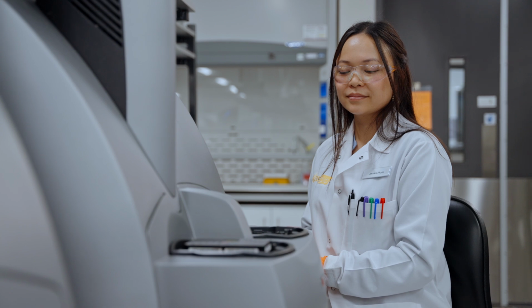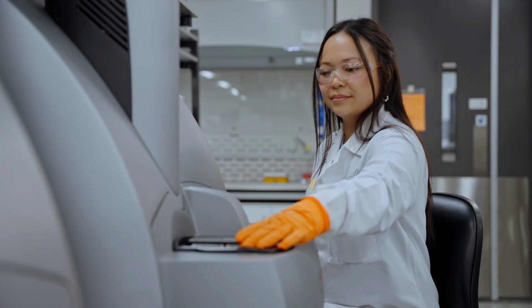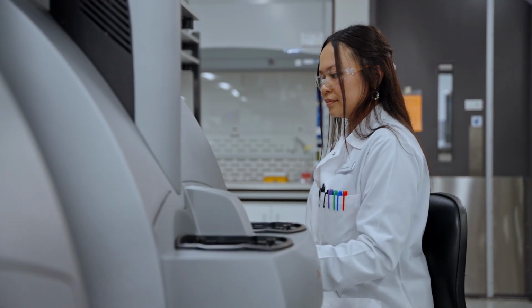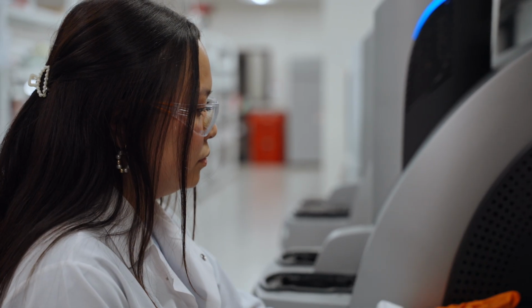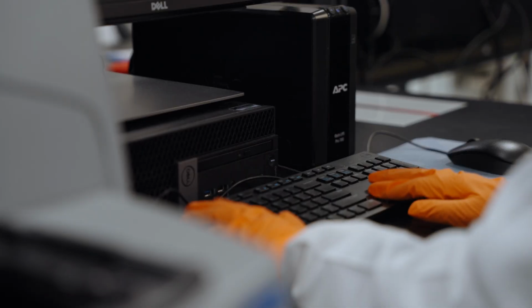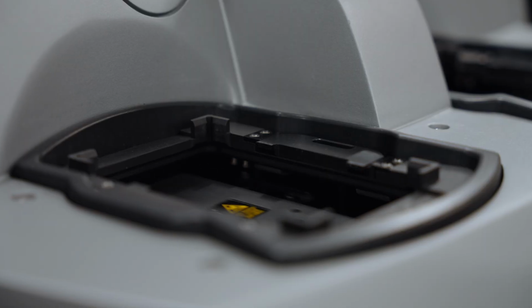Dynamic range is the big one. They'll tell you on the catalog that you're going to get about 6 log dynamic range. In practice, it's not far off if you have well-characterized reagents. It's also extraordinarily consistent. There's no enzymatic steps, so when you are getting your assay readout, there's no art in understanding what your signal development is. It is add reagent, acquire data, and for that reason, it can be very consistent over time, over technique as well. The machine's importance in one sentence: it has a very healthy level of support for consistent quality from both a manufacturer standpoint as well as data validation.